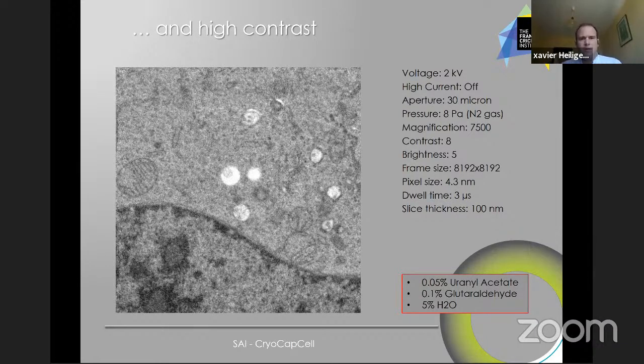And since during freeze substitution, you might have some minor alterations in the ultrastructure or some general deformation, shrinkage, growing of the structures, your live cell imaging might be slightly off from your plastic block. And therefore doing fluorescence imaging in the resin will bring you the conviction that your fluorescence overlays perfectly with your electron microscopy.